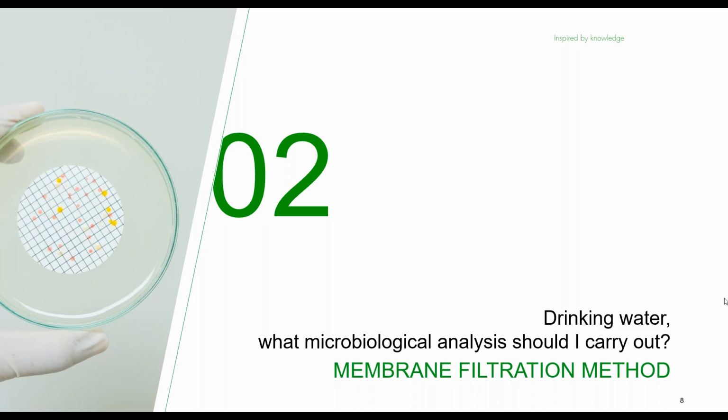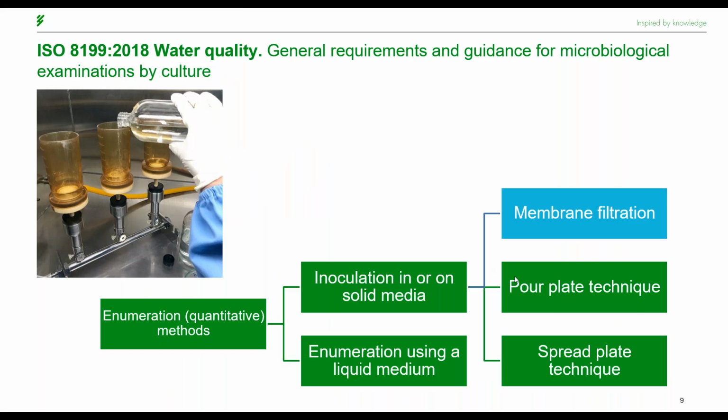So now, in the second part of the webinar, we will quickly review one of the most used techniques in water analysis, which is, of course, the membrane filtration method. For this, we have ISO 8199, where the techniques for the detection and enumeration of bacteria, molds, and yeasts are indicated to evaluate the quality of the water. In counting methods, there are three techniques: the method of membrane filtration, the pour plate technique, and the spread plate technique.